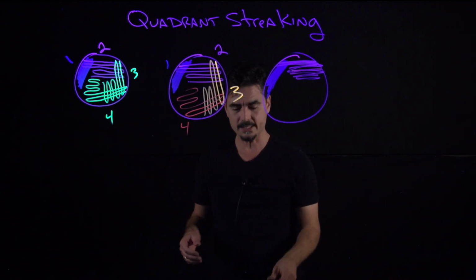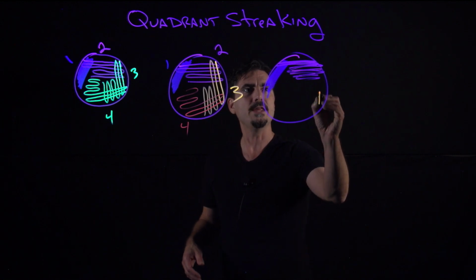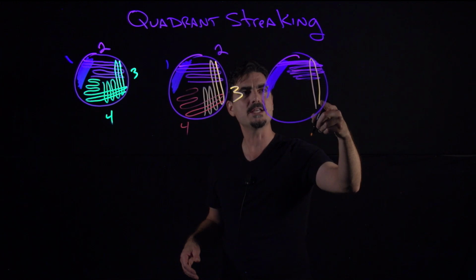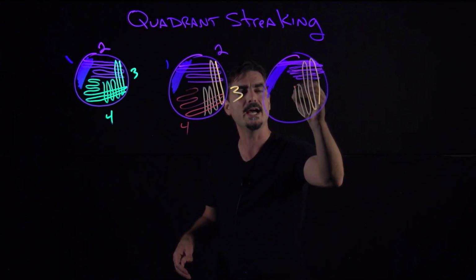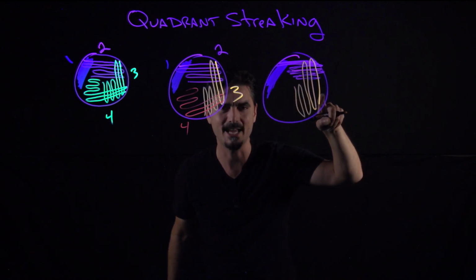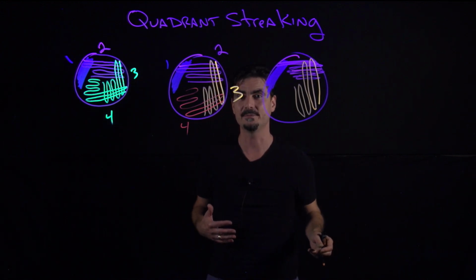Okay? Another thing that some students will do is they'll start like over here, and they'll go in. Well, you just started in an area where there's no bacteria, so although you may end up getting the right answer because you do go back in, you still may get isolated colonies. You did it in kind of a goofy way that doesn't make sense, right? But things like that, at least you can overcome as long as you've got bacteria growing on there, okay?